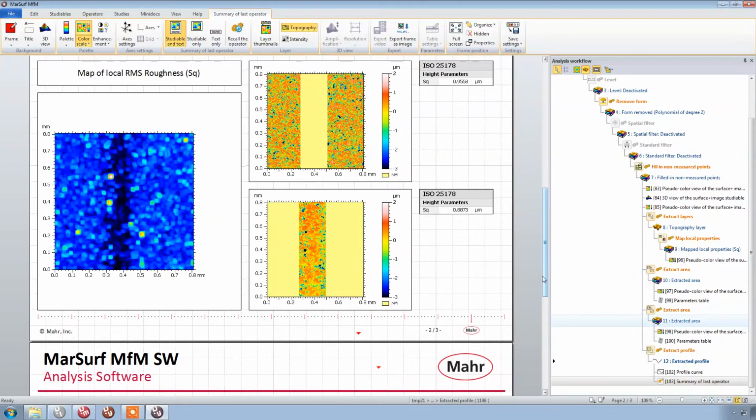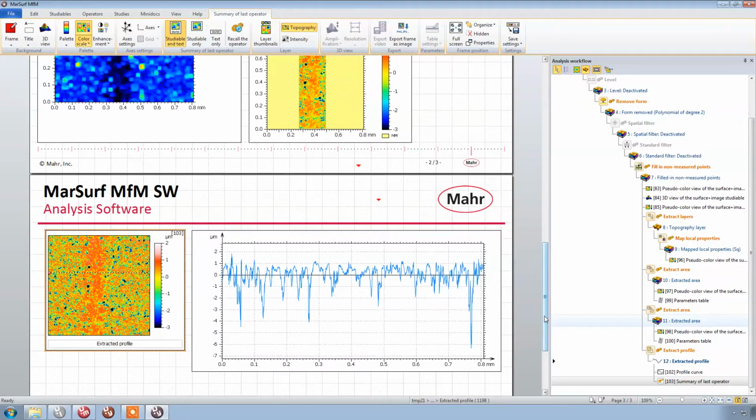The second point, because we have a 3D digital data set, a 3D data set most importantly, we can start to see things in 3D that we might have never picked up just looking at the 2D data set. The third point, and I forget about this, is this ceramic is actually a pretty difficult surface to measure, but it's so easy with this tool that it becomes a triviality. It's not the point anymore. But just the fact that we got data from this is pretty exciting.